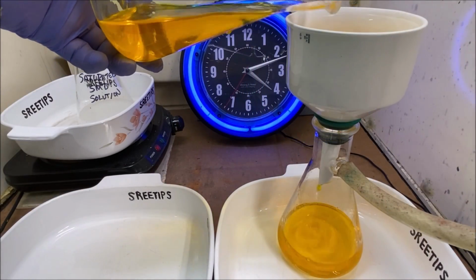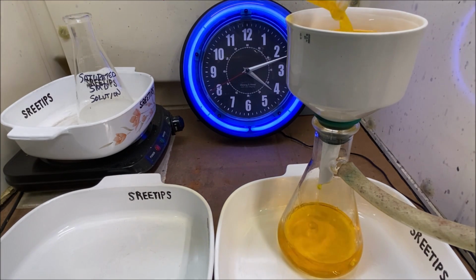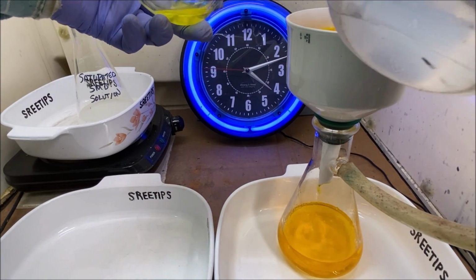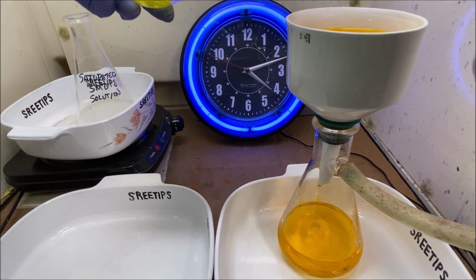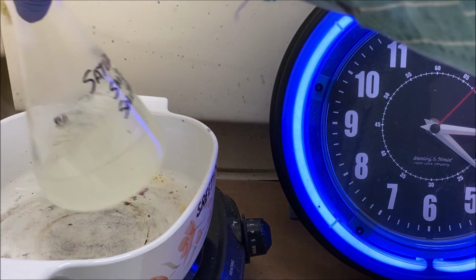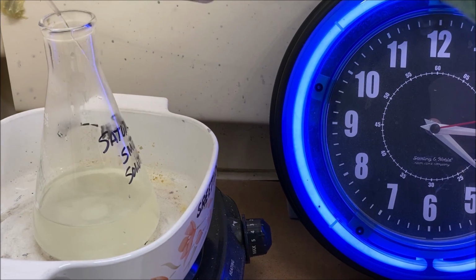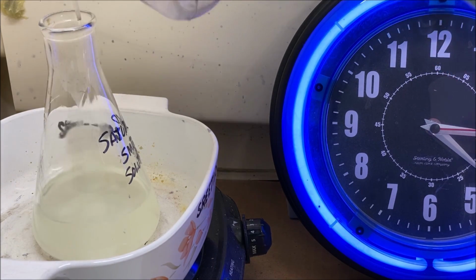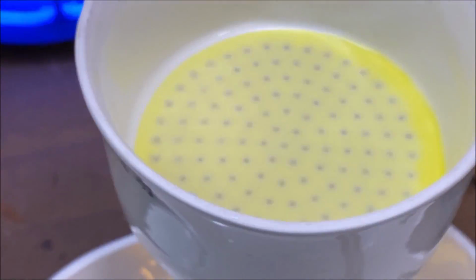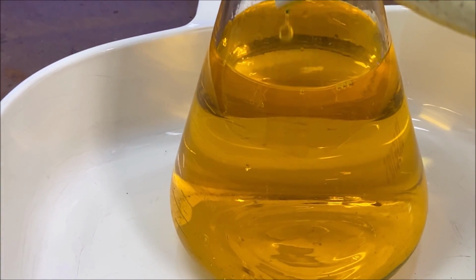The solution is clearing up nicely for us. When refining this kind of scrap, there's always going to be some trash that tries to follow the gold. There's all the trash that we filtered out of our gold solution, and it looks real good now. Nice and clear and bright.